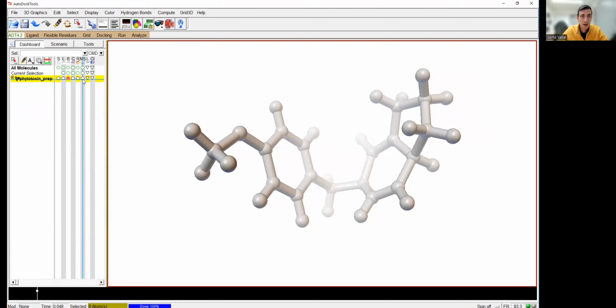Here we can add labels. And the last column stands for coloring. It opens an additional window. And here let's apply some coloring. We can make a custom color. Let's make it green. After this, remember that when you work with molecular models, you always have to keep the standard coloring schemes. For this, select here by atom type.